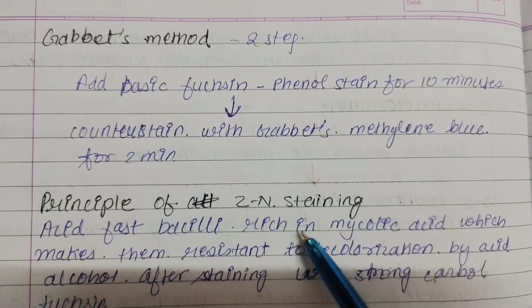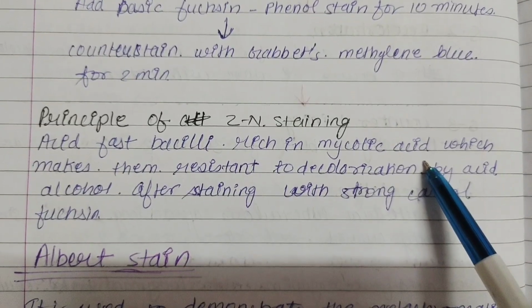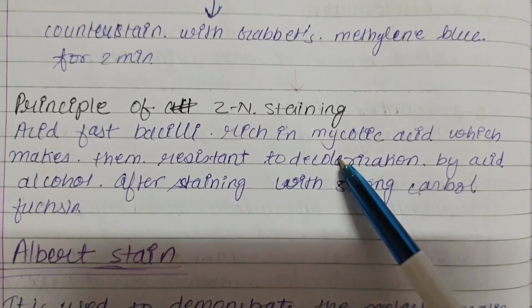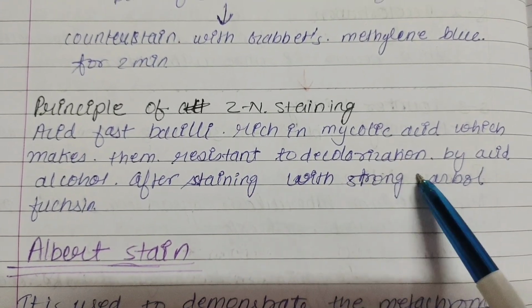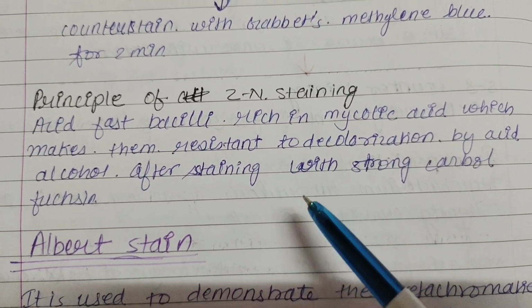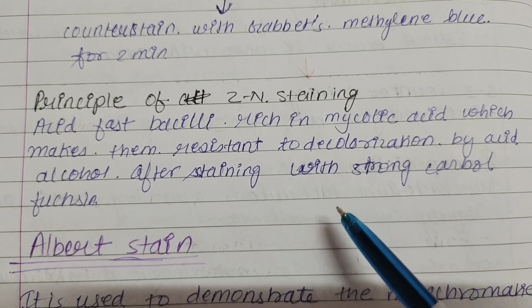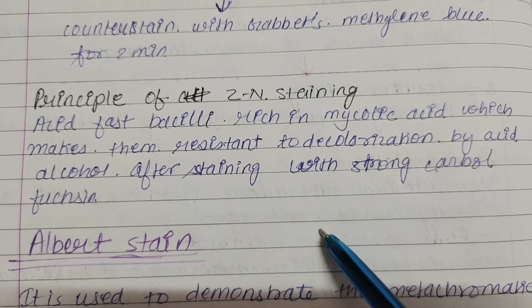Now the principle of Ziehl-Neelsen staining is that acid-fast bacilli are rich in mycolic acid, which makes them resistant to decolorization by acid alcohol after staining with strong carbol fuchsin. That's why acid-fast bacilli do not take the counter stain, and heating is done so that carbol fuchsin penetrates the cell wall and enters the cell of the bacteria.